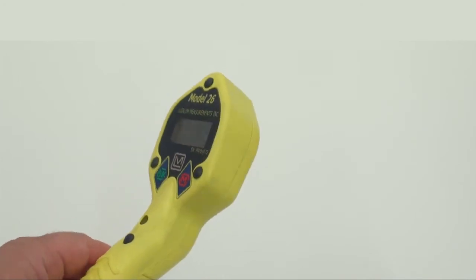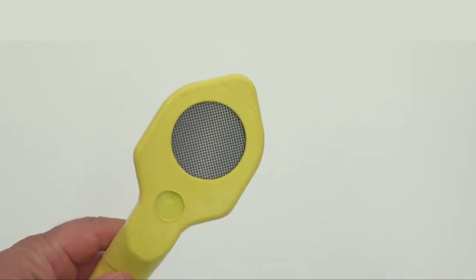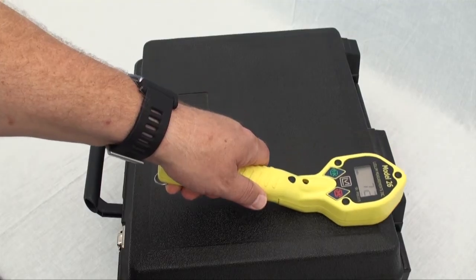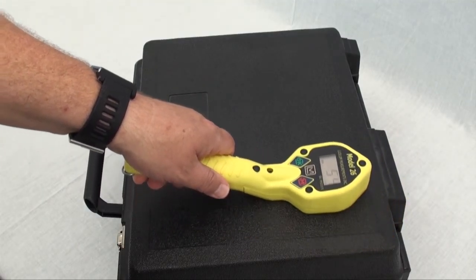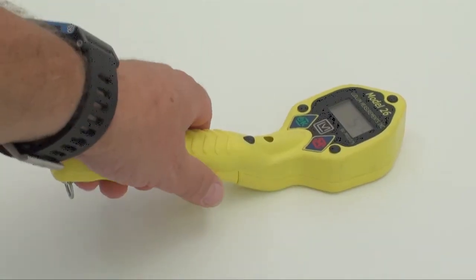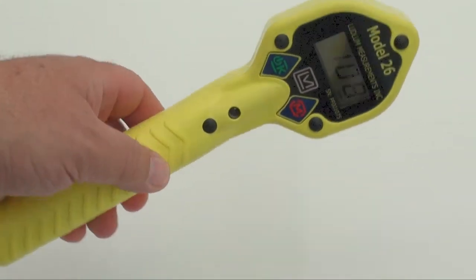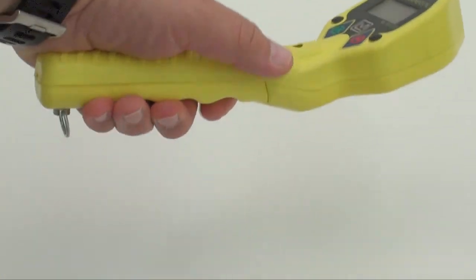This instrument is based on the industry-standard 15-centimeter-squared GM pancake probe, which makes it ideal for checking personnel and articles for radioactive surface contamination. The instrument is constructed from durable plastic and is covered with a rubbery coating to enhance resistance to weather while providing a very comfortable non-slip hold.